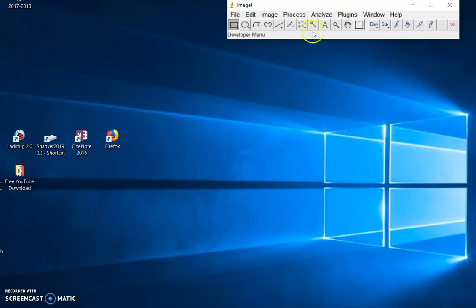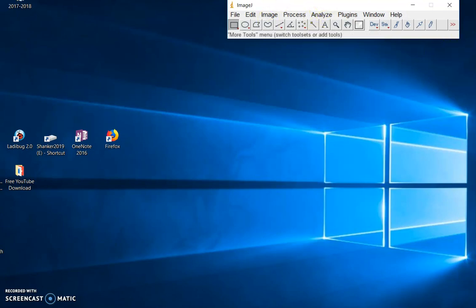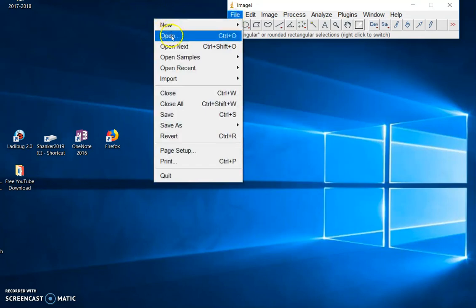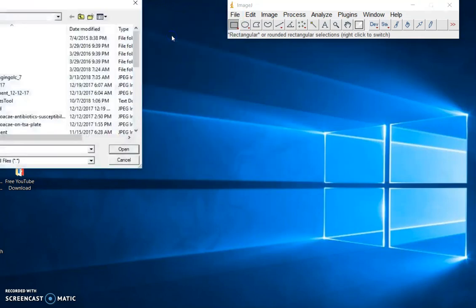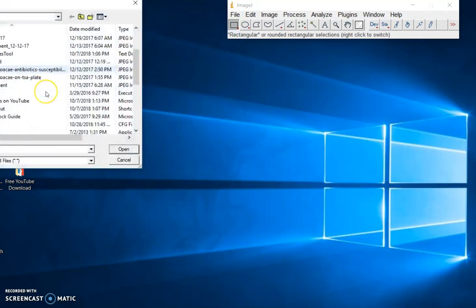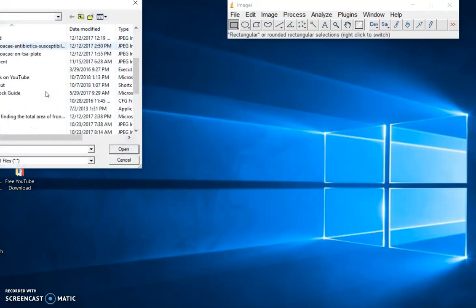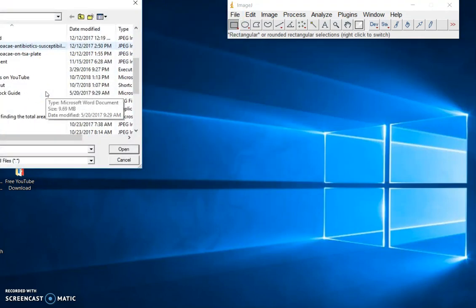So first, I have ImageJ open. The application is ready to go. I'm going to click on File, I'm going to click on Open, and I'm going to get the image that I want to count frogs.